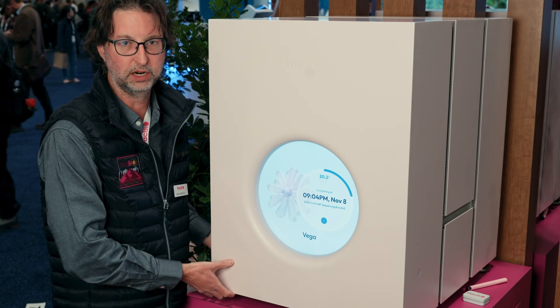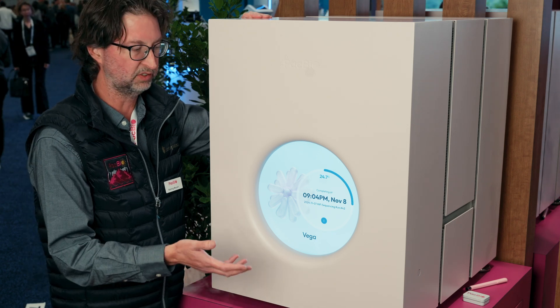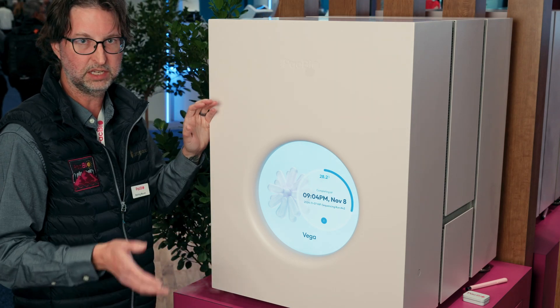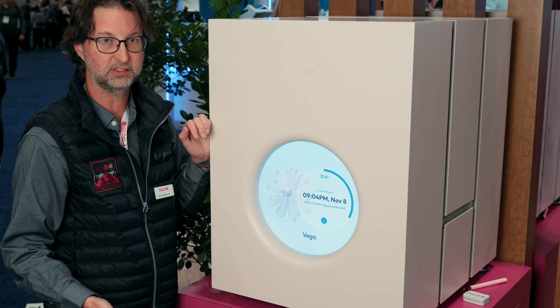And you can put this thing anywhere. This is only a couple hundred pounds — you can put it on a benchtop. It plugs into standard power, you can run this anywhere, and you can get nice long HiFi reads. It's the exact same chemistry that we use for Revio, so if you know how to use Revio, you already know how to use Vega.